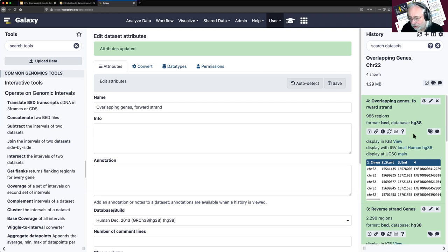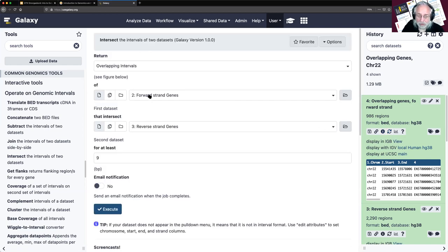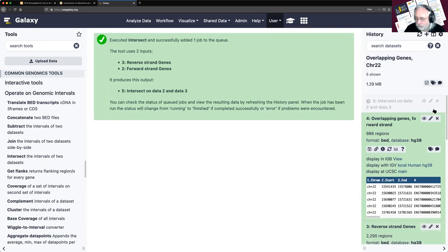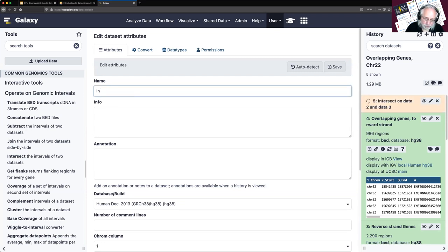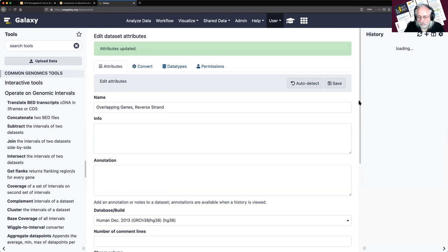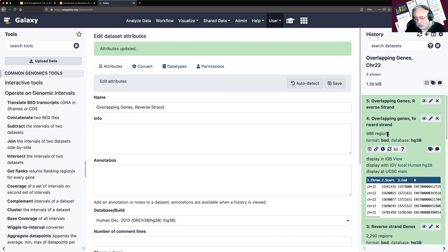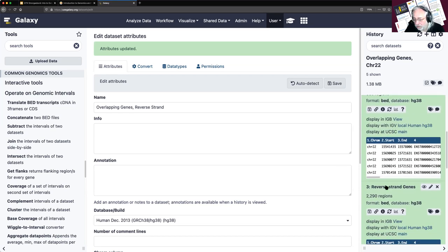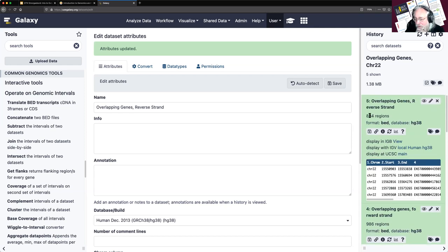Let's do it again for the reverse. We use 'Run This Job Again' and flip the datasets — reverse first, forward second. This will produce a list of reverse strand genes that overlap. I click Execute and rename the result. Expectations game: if this is correct, between a third and 40% of 2,290 should be around 834. And yes, we got approximately that. So if the forward result is right, then this is also plausible.